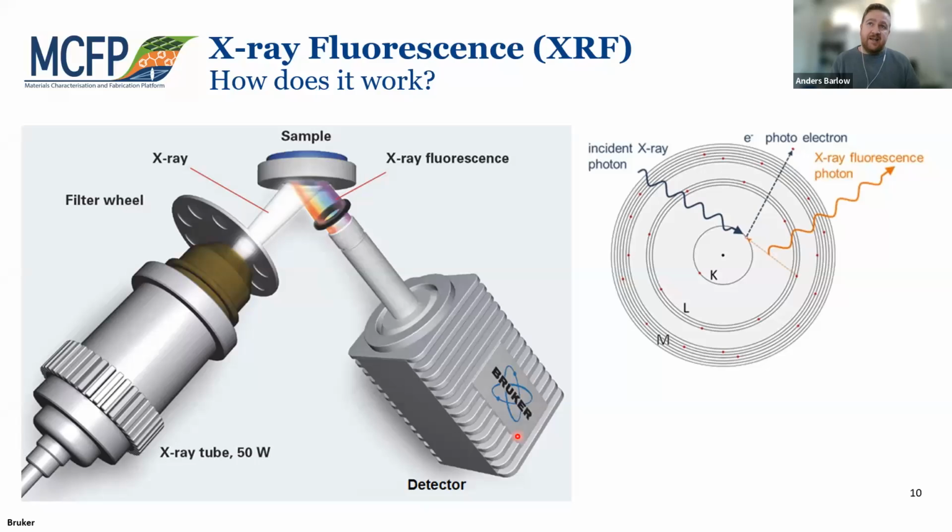There is another technique called wavelength dispersive XRF, or WD-XRF, and they are typically higher resolution and can take you down to ppm sorts of detection levels as well, and they're treating X-rays as waves. So they're a different setup, a different geometry, larger instruments, more expensive instruments. This is the simpler technique called energy dispersive XRF.